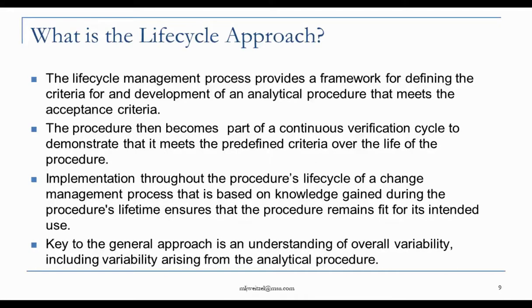What is the life cycle approach? The life cycle management process provides a framework for defining the criteria for and development of an analytical procedure that meets those acceptance criteria. The procedure then becomes part of a continuous verification cycle to demonstrate that it meets these predefined criteria over the life of the procedure.